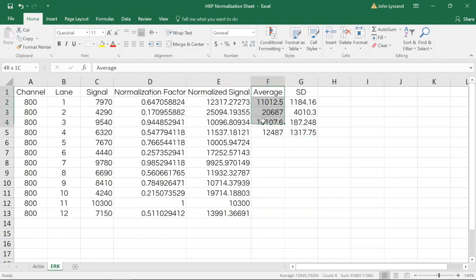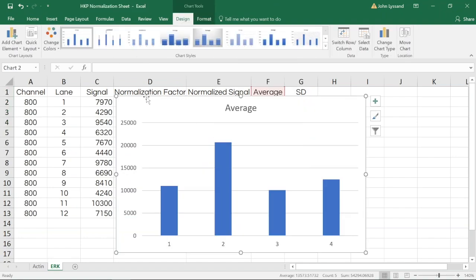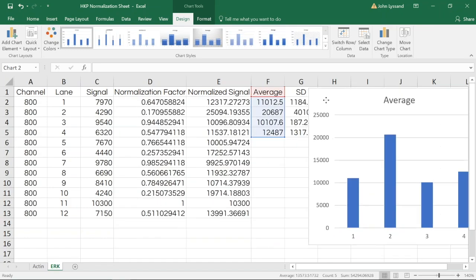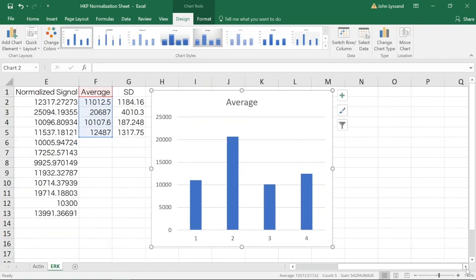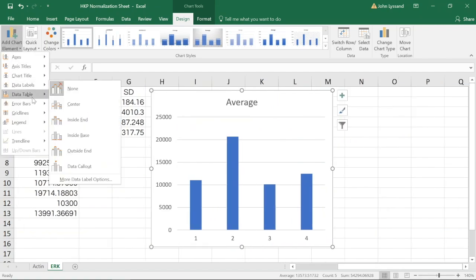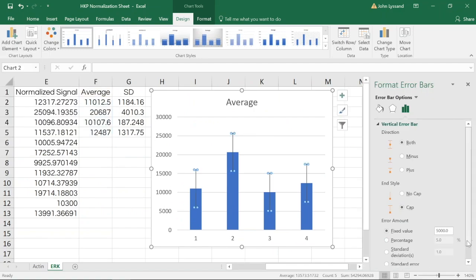If I want, I can also select this data and using even more Excel functions, create side-by-side plots of this data. Since I have the standard deviation, if I want, I can also add additional elements encompassing that standard deviation as well into Microsoft Excel.